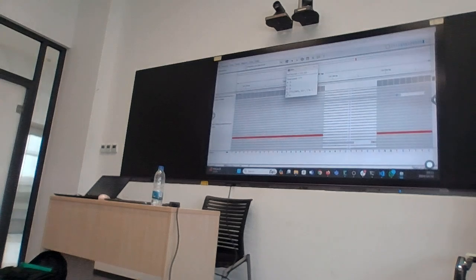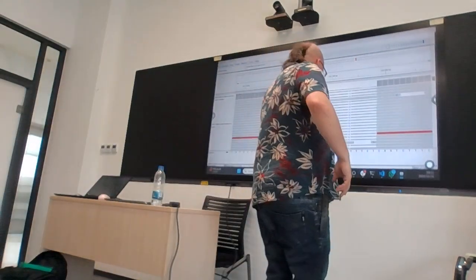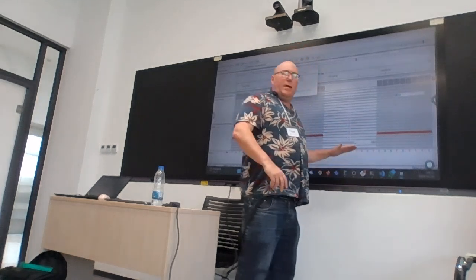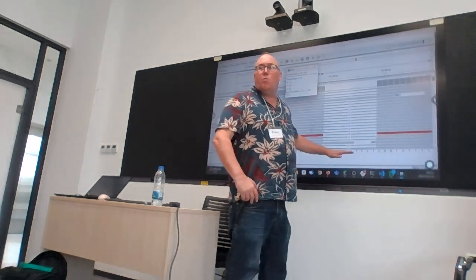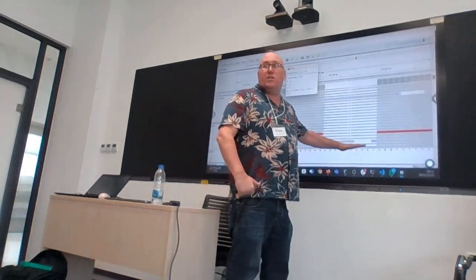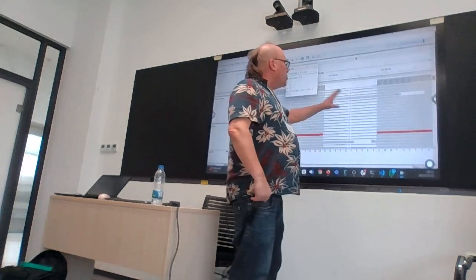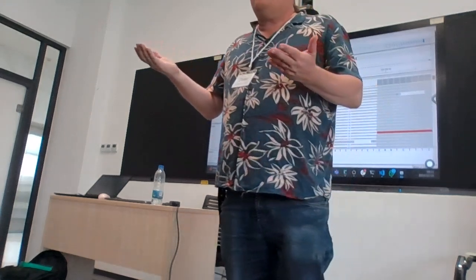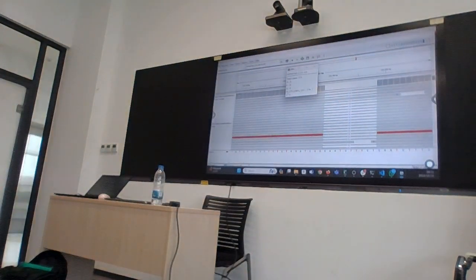Remember there are repeats. There are repetitive regions in the genome, okay? So let's take this: CAA, TC, TT, CC. Let's imagine that somewhere else in the genome, there is also CAA, TCC. There's something that looks exactly the same. The read was mapped to the wrong position, and it is maybe that. There can be other reasons. So how do you differentiate? With difficulty.